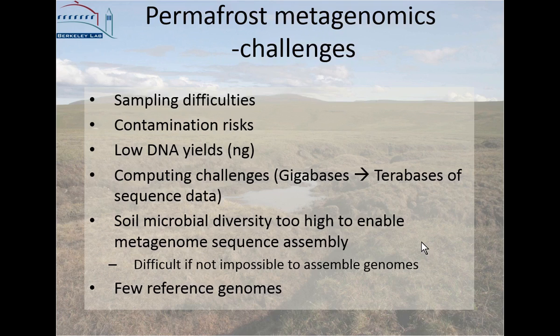There were some challenges for this study that were at first not computational. At first it was just to get the samples and get the samples frozen back to the lab where I was working. And then the contamination risks, because I was working with the deep, some people say that for the people at VTT it's not deep, but it was a 1 meter depth sample, so I just needed to make sure that I was actually sampling the correct depth and not contaminating the deeper soil layers. The DNA and RNA yields in permafrost were not that high, so I needed to extract a lot of DNA and RNA to get enough for sequencing.